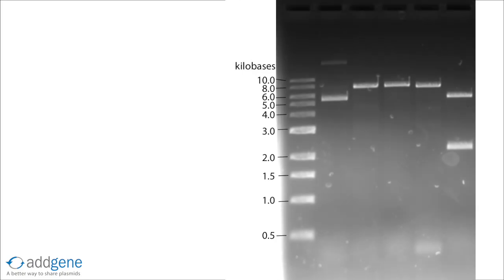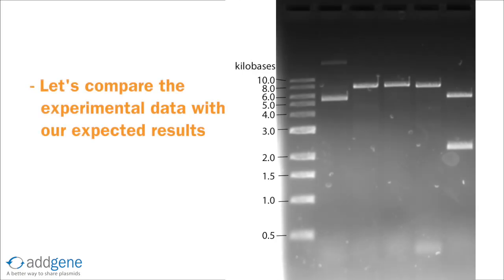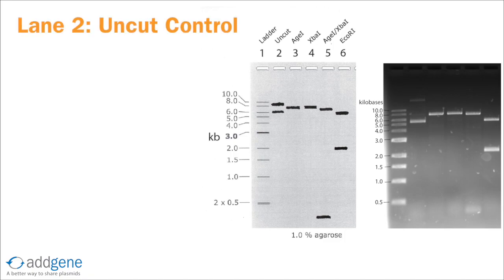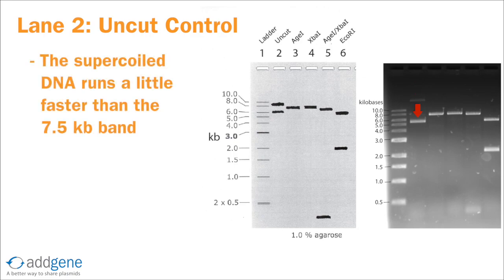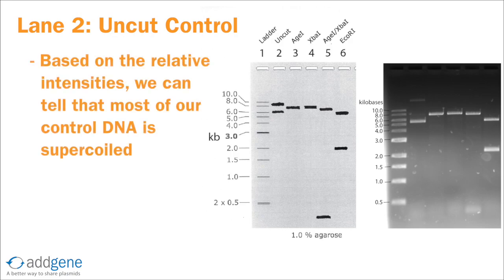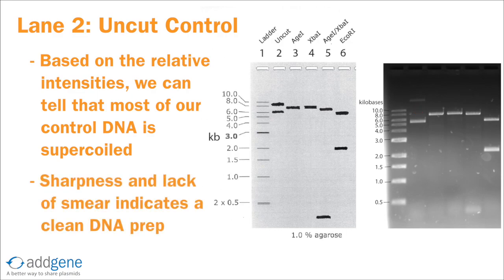Now that we've run our digestion, let's go through each lane and compare our experimental data with our expected results. We've marked the ladder with the sizes of the markers. Lane 2 is the uncut negative control. We expect to see a supercoiled band and a nicked band, and that's what we see here. As expected, the supercoiled runs a little faster than the 7.5 kb band, and the nicked runs a little slower. Based on the relative intensities of these two bands, we can tell that the majority of our DNA is in the supercoiled conformation. Also, based on the sharpness of the bands and the lack of smear, we can deduce that we have a clean DNA prep.